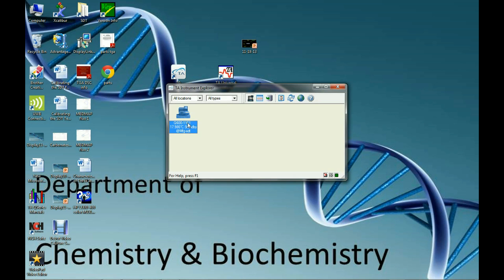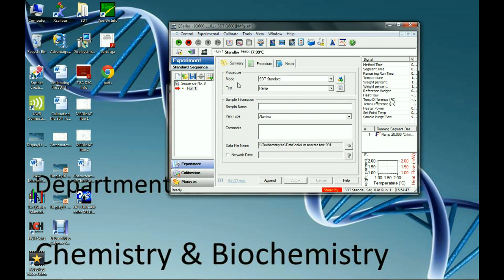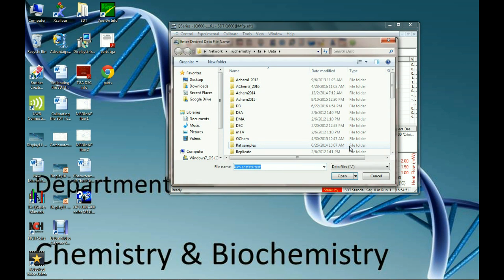In order to set up our experiment, we need to go to the TA Instrument Explorer. Double click this icon here, and it will open up the program which we'll use to create our experiment. So first thing we're going to do is change the data file name. I'm just going to call it calcium acetate test.